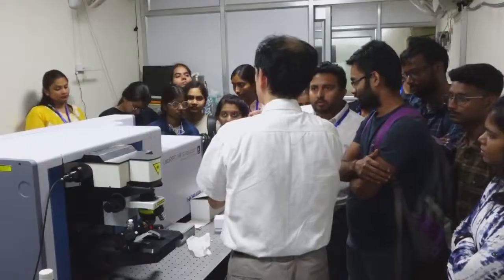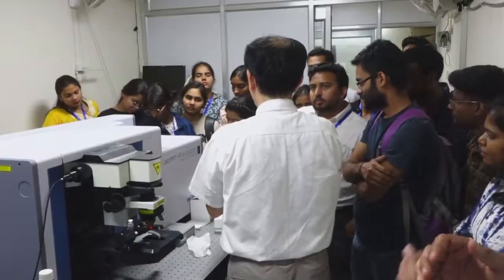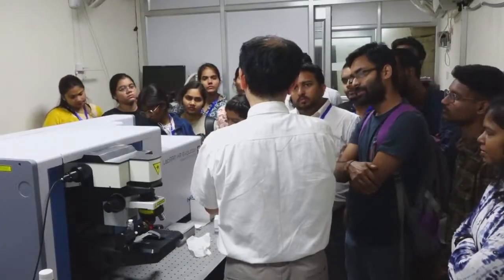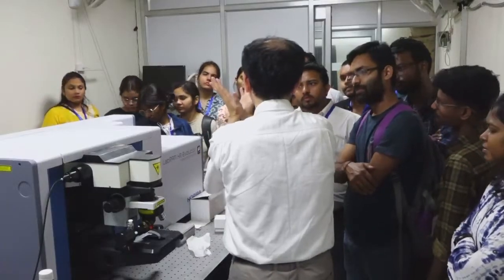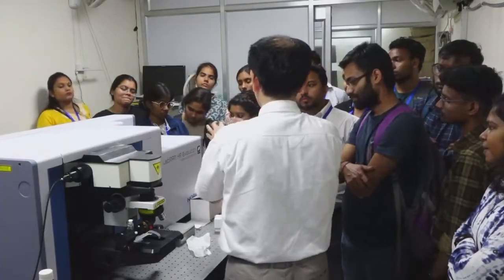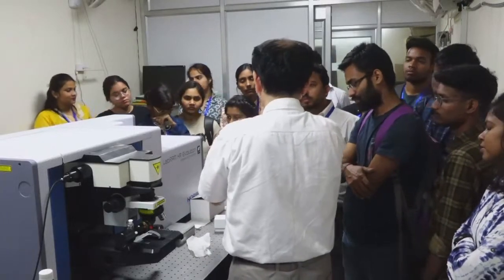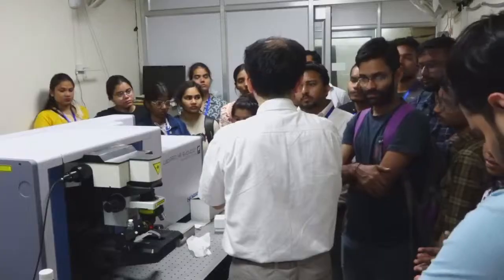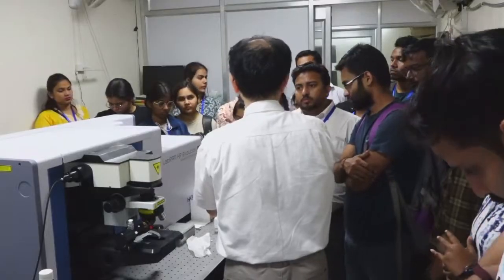Typically we use 100 milliwatt or so for the measurement of organic solvent. But in the case of a living sample, 1 milliwatt, 2 milliwatt, very weak laser power is tightly focused on the living cell. Then we can achieve spatial resolution because the spot is small. So we can scan each point and avoid damage. Reducing the laser power is the one and only method to avoid it.